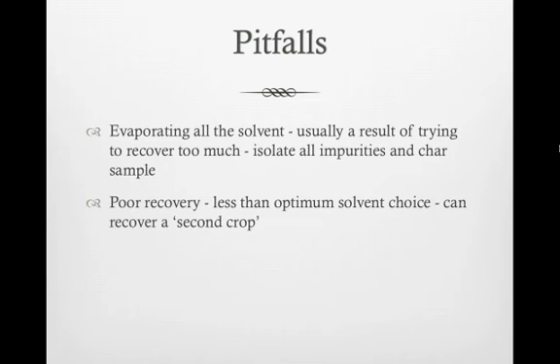Pitfalls. What makes recrystallization a real difficult proposition? One is that many students are so yield happy that they evaporate too much solvent, trying to get too much stuff. So essentially what the student winds up doing is dissolving it and then completely evaporating the solvent. That doesn't take away any impurities. And as a matter of fact, the excess heating that you get as you drive off the last of that solvent winds up charring the sample. So you're actually worse off than you were at the beginning.